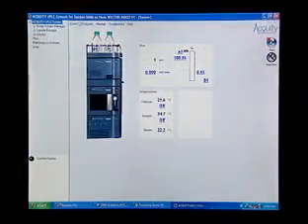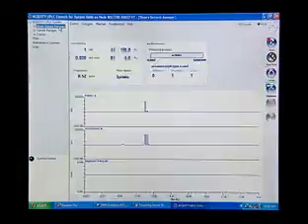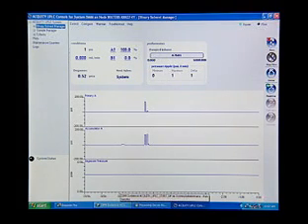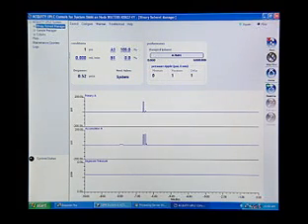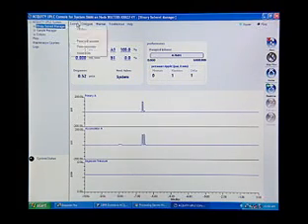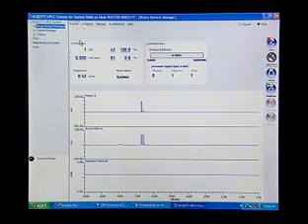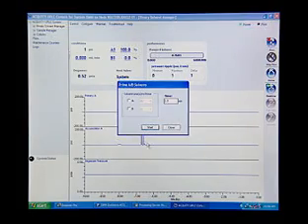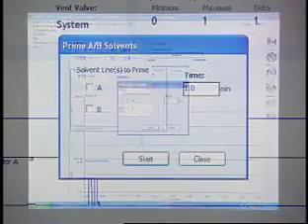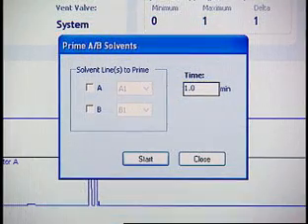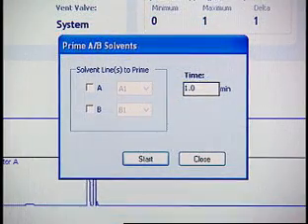In the console, select Binary Solvent Manager from the system tree. In the Binary Solvent Manager information window, click Control - Prime AB Solvents. The Prime AB Solvents dialog box appears.